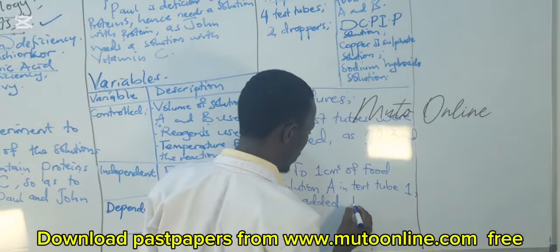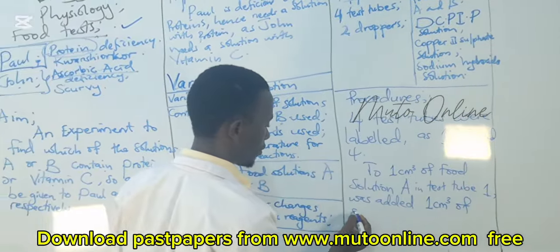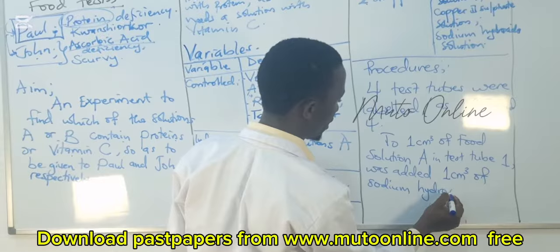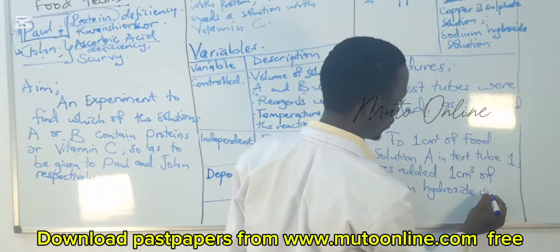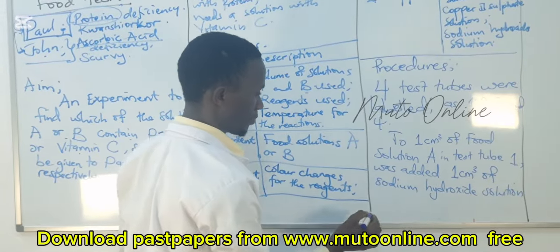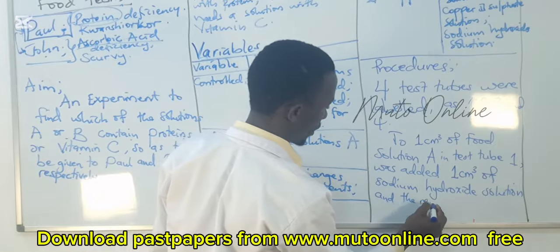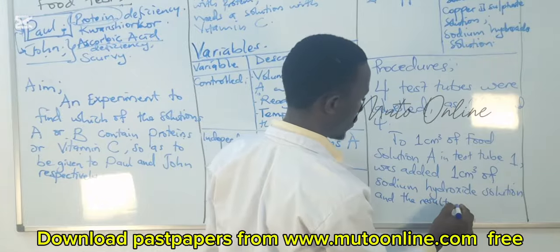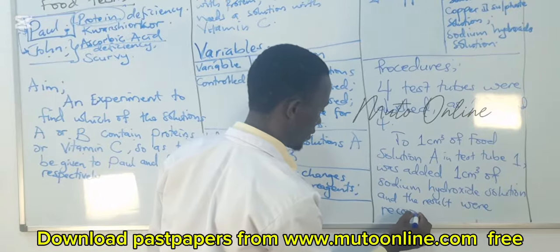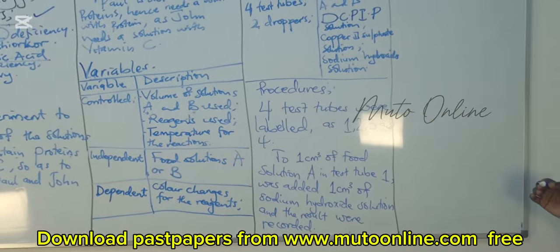Was added 1 cubic centimeter of sodium hydroxide solution, and the results were recorded. I think we can see this.